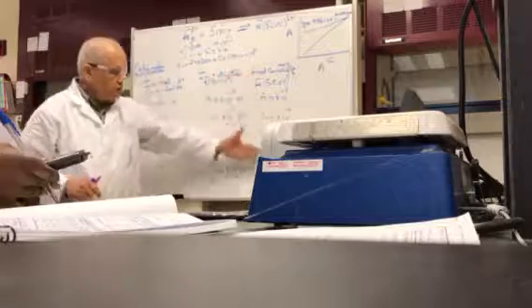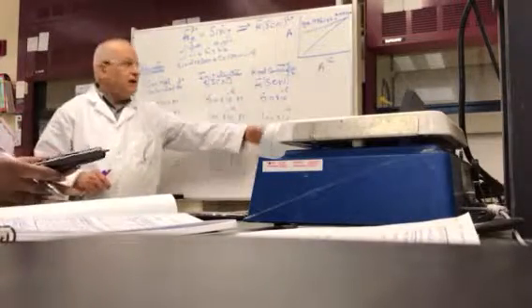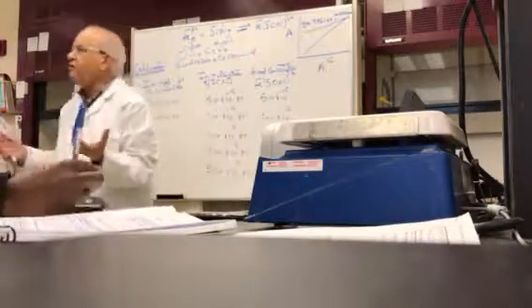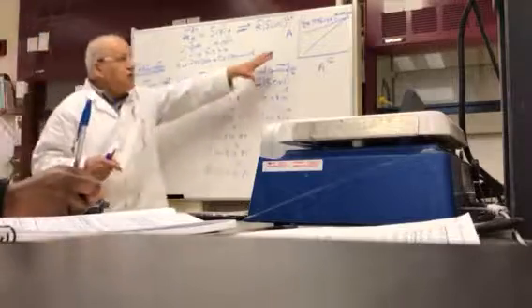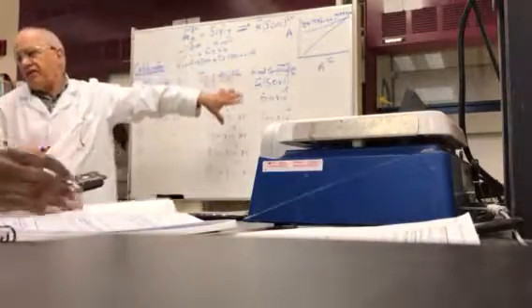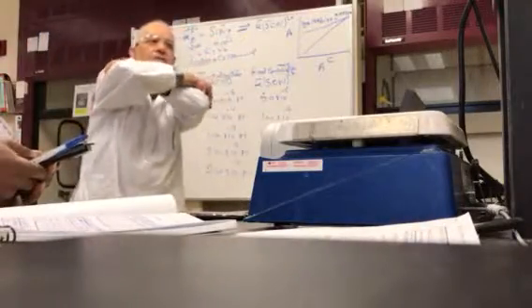Very simple. You already got the data here. If you use 1 milliliter, use this data. And then you already measured the transmittance. You know how to convert it to absorbance. A equals 2.00 minus log percent transmittance. Convert that, and you will generate the graph. You cannot do anything in the equilibrium before you get your graph here. Okay, we good here? Calibration, good?